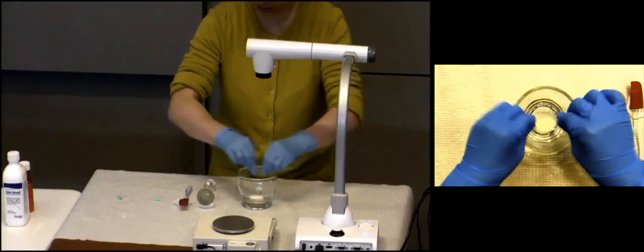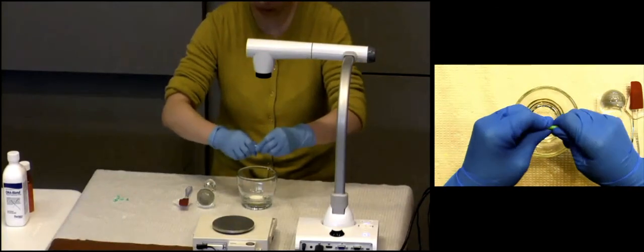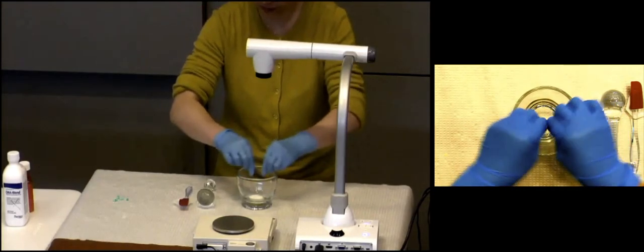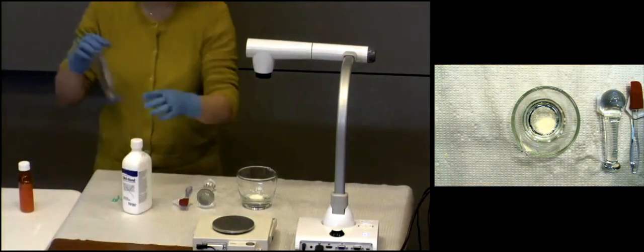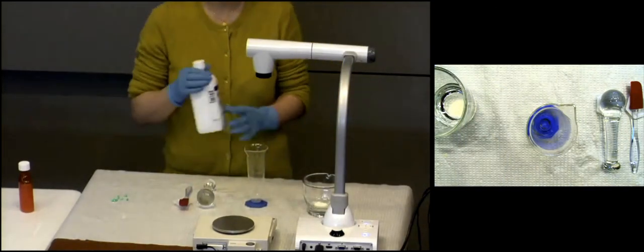But here, and I don't mean to interrupt Judy, this is an important thing. When we add the powder to our liquid, will it occupy a certain volume? Will it displace a certain volume? Do we need to consider that? The answer is no. From a practical standpoint, and you'll see that today with your own, the displacement of that powder is so small or insignificant it will not influence anything. Trust me, by the time you're all done, without even taking it into consideration, you'll probably have less volume than you thought you had due to loss on the mortar and loss in your graduate and everything else.